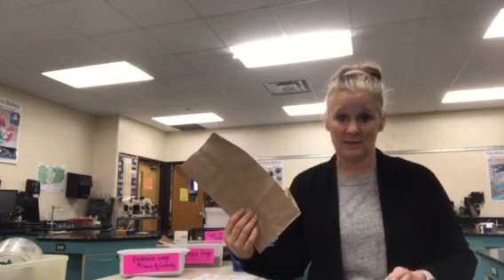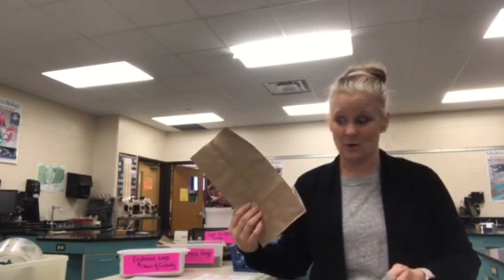What if it was some soil or sand scrapings off of the bottom of somebody's shoe and you needed that to prove that they were at a certain location? Well, if it's down in the bottom of the bag, that's going to be awfully hard to get it out and analyze underneath the microscope.